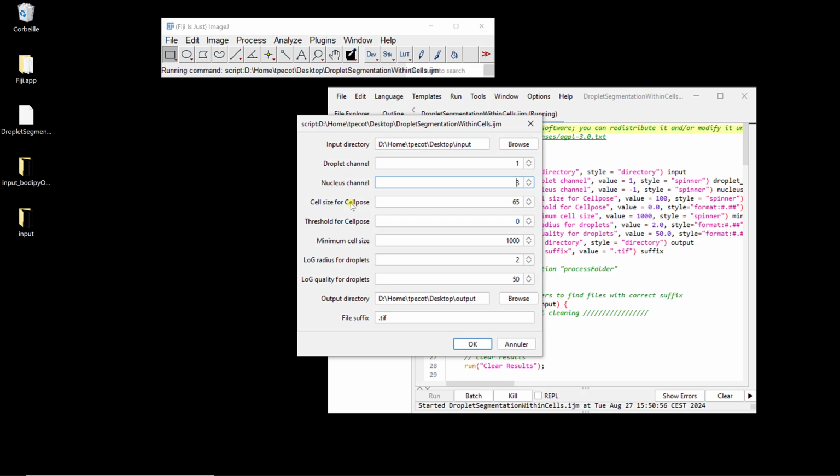If you find that you don't segment enough cells, you can try to push it by using negative values. The main caveat when you do that is that generally you overestimate the area of the cells. Depending on your biological objective, it might be a problem. For example, here you might find droplets outside the cells that you consider in the cell. If you find that you segment too many cells, you can increase this parameter with a positive value. Hopefully 0 will work fine.